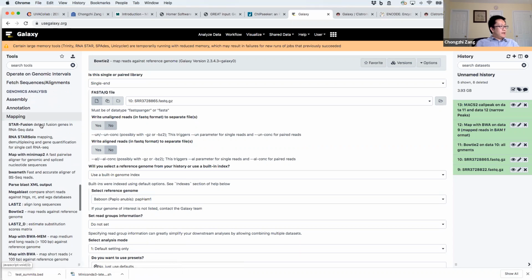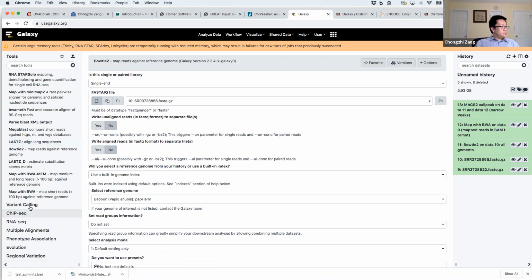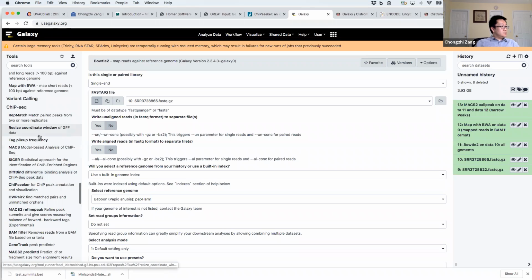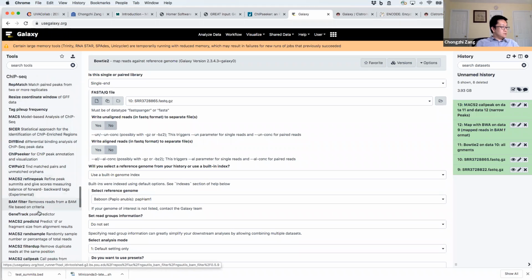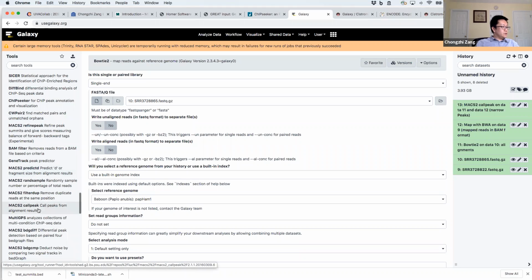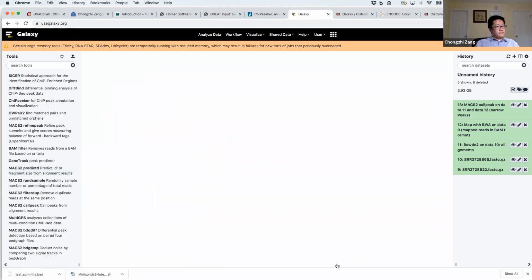They have BIOC8145, as you can see here, and ChIP-seq data. They also have ChIP-seq peak calling tools, including MACS and a ChIP-seq tool for broad peak calling, and also several other tools for MACS. I think this MACS is version 1, and we more frequently use MACS2 to call peaks. Just to give a few examples.